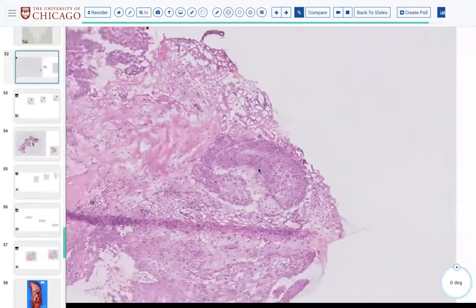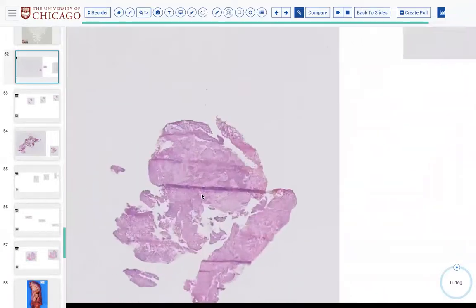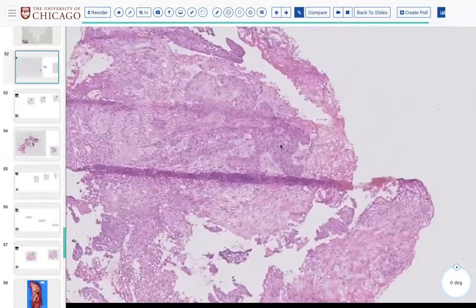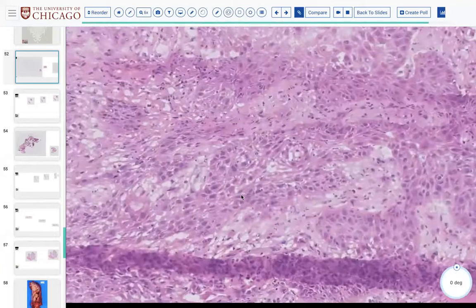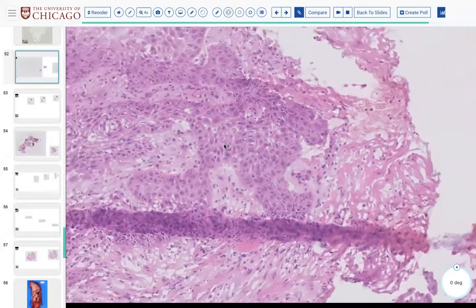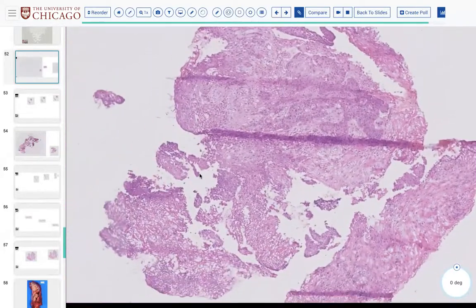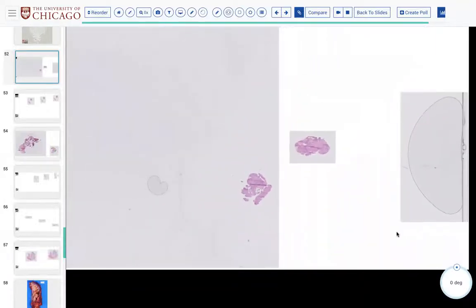So sometimes on occasion, they will send you the lesion because for some reason we haven't reviewed the outside preoperative biopsy or something, and they just want to make sure that they're not completely off base. So sometimes they'll send you the lesion just to confirm, yep, this is it. And then they take the specimen out. Sometimes they see little areas in the mucosal surfaces that are not the main lesion, but separate, and they think, oh shoot, there's something else in this patient's mouth.